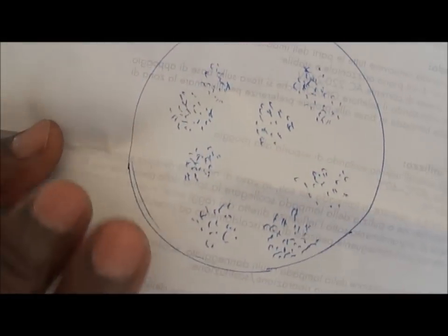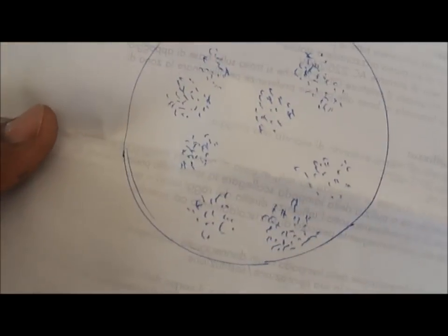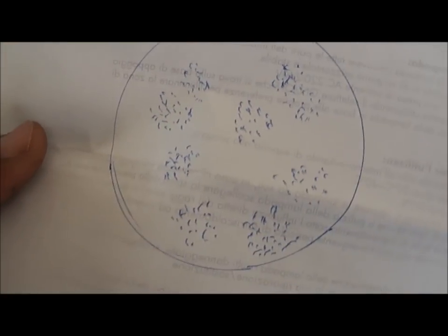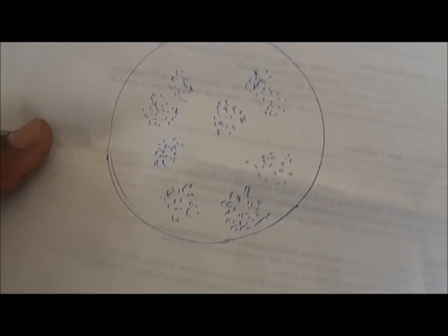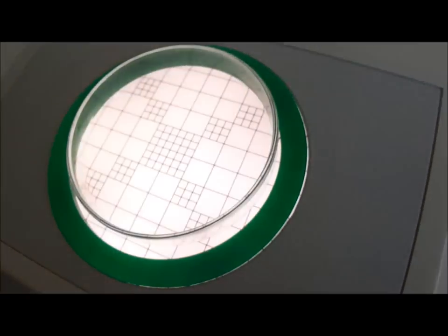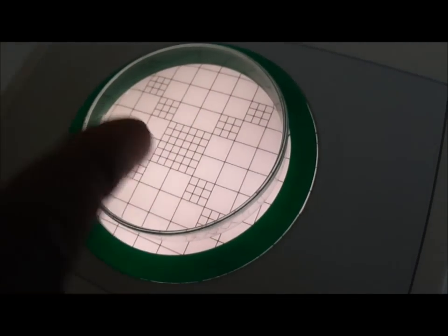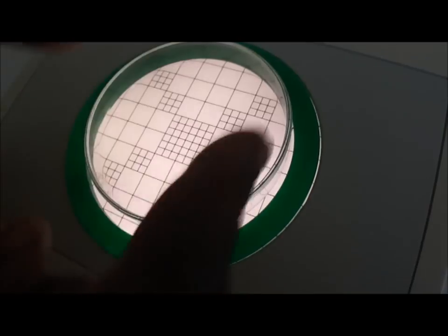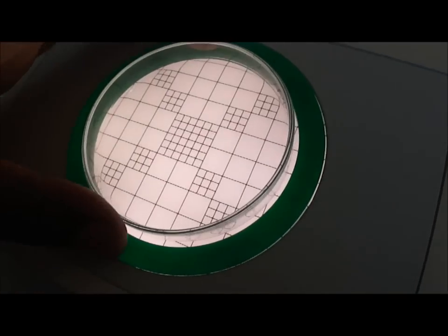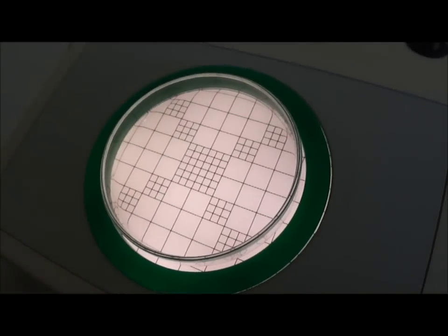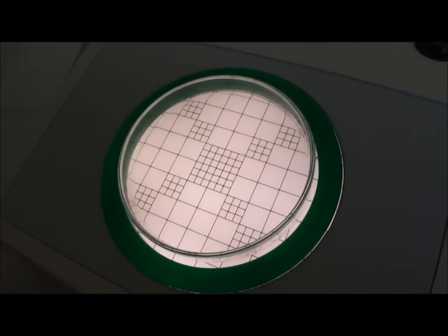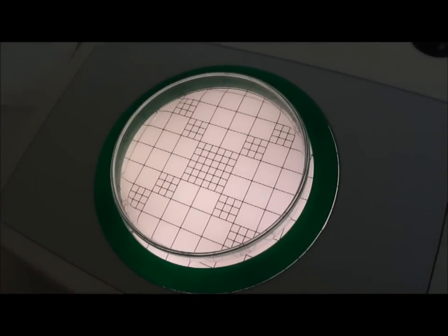And to make it easier, sometimes more, much more densified than this, and then it's difficult to count. And then you put this on the top, and since the petri dish is transparent, you can see the colonies inside, and you have these squares inside that will make your counting easier.